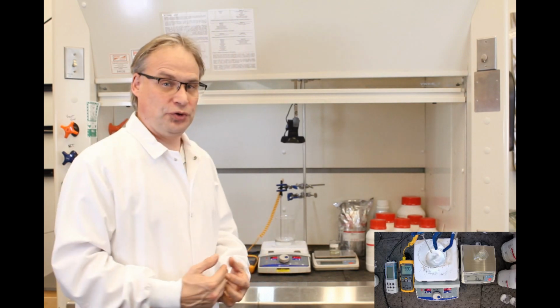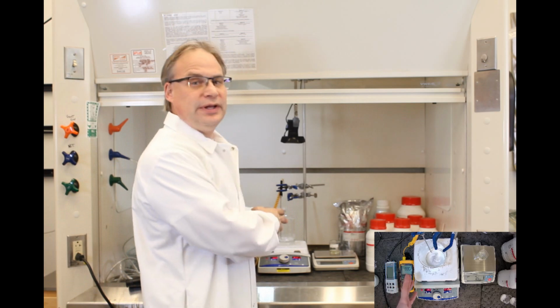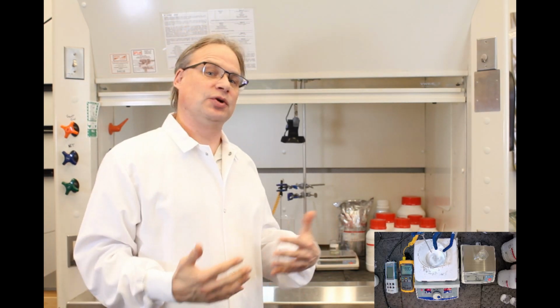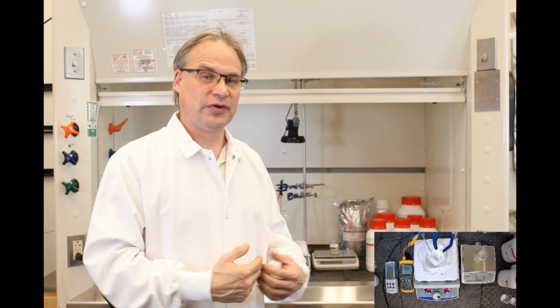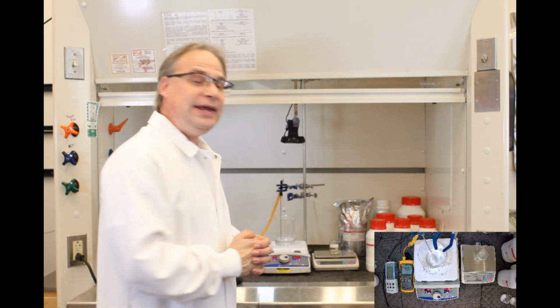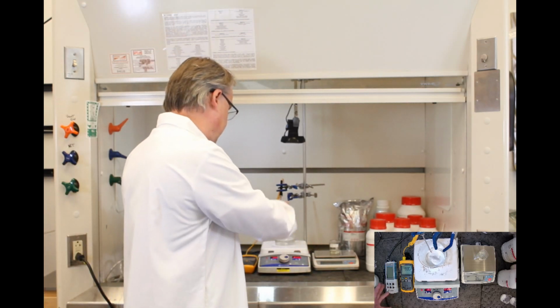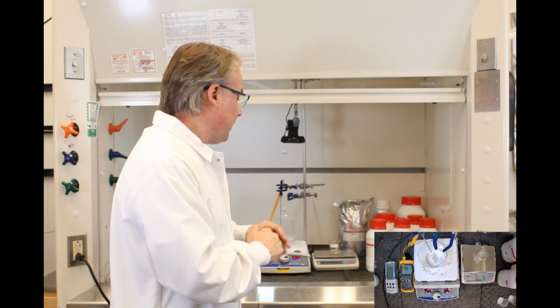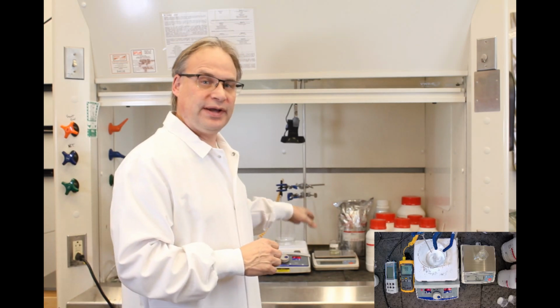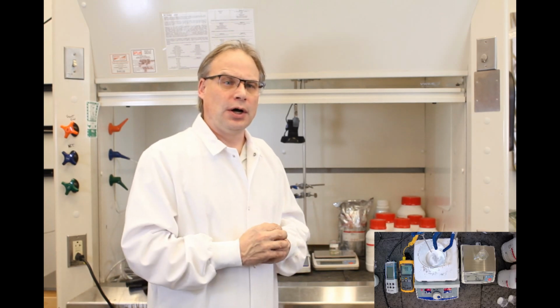So without further ado, what I'm doing is I have set up a solution here of 100 milliliters of vegetable glycerin, which just so happens that the benzoic acid and the nicotine are soluble in. So it means we can make our salt in a safer medium. I've preheated this vegetable glycerin to 66 degrees Celsius, as you can see in the fume hood. Lastly, I've pre-weighed some pure nicotine. Pure nicotine is water white, has the consistency of kind of like water, but a little oily, and again, very, very dangerous.